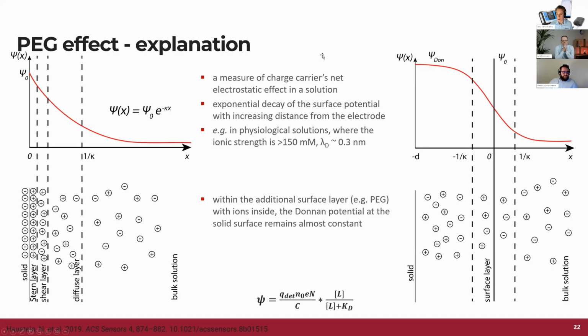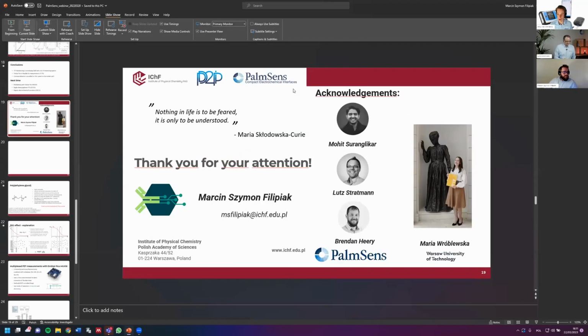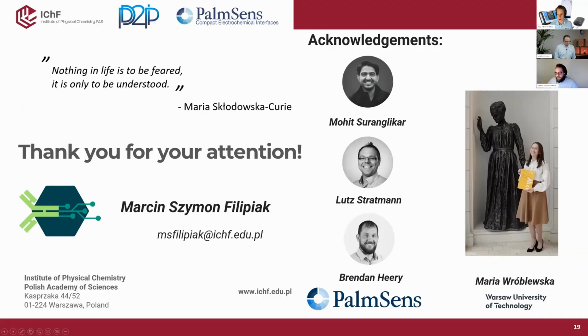Right, thank you. And then the last question: what are the crucial parameters when it comes to choosing your FET transistors, like N-type, P-type, the voltage? Well, what do you have to take care of? Depending obviously on what you want to do. When it comes to, for example, extended gate field effect transistors, where you use commercially available FETs, what you should look for is a low threshold voltage. So make sure that this is in the range of the voltages that EmStat Pico is capable of providing.